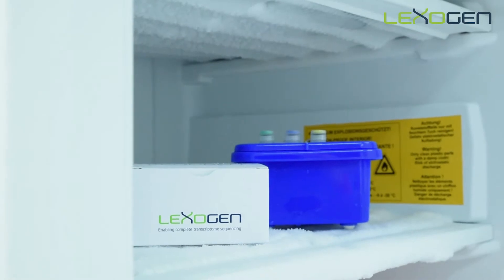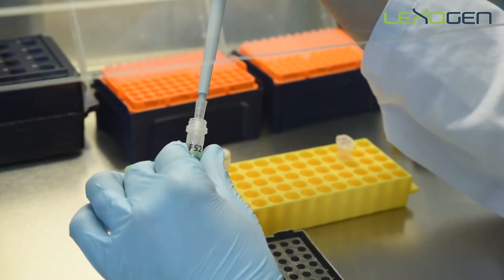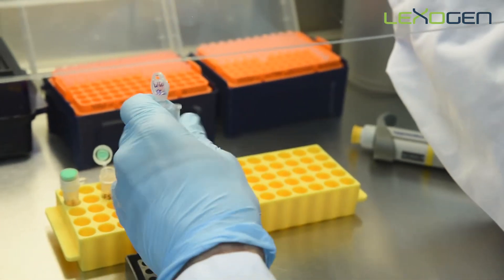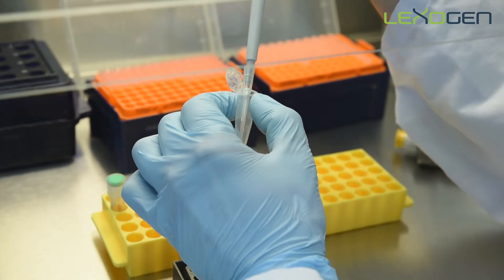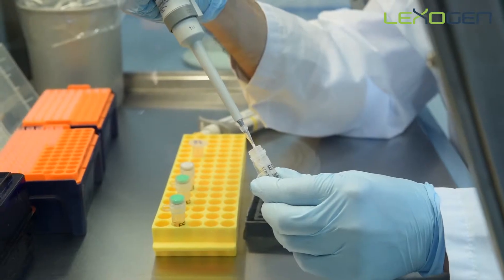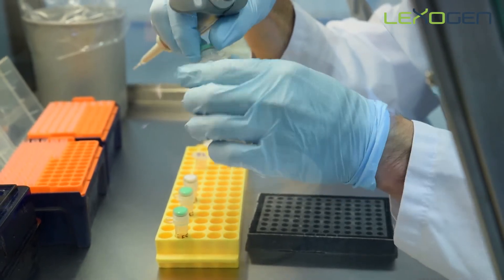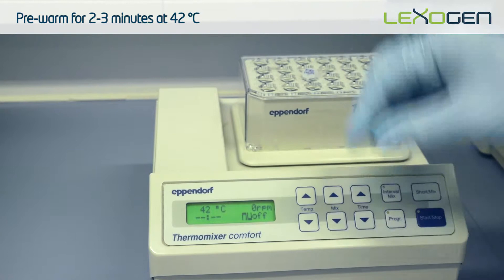Retrieve the enzyme mix E1 from the freezer and prepare the first strand synthesis master mix by combining FS2 and E1 enzyme. Pre-warm the master mix at 42 degrees for 2-3 minutes.